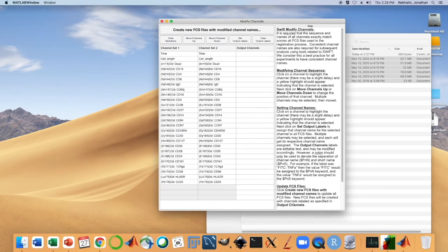This is a CyTOF dataset, so there are lots of channel names. The trick is finding the ones that are different. It looks like everything is fairly consistent except for this last one here. So I will just include all of them for now.